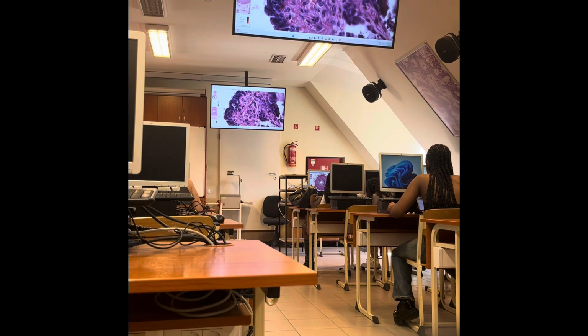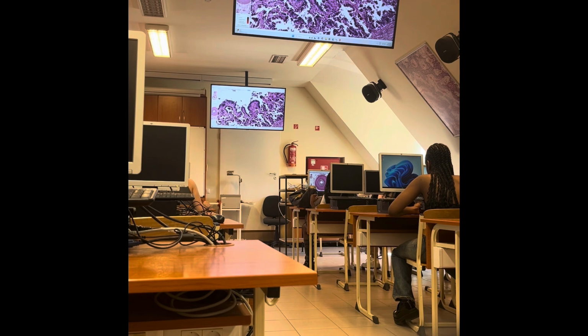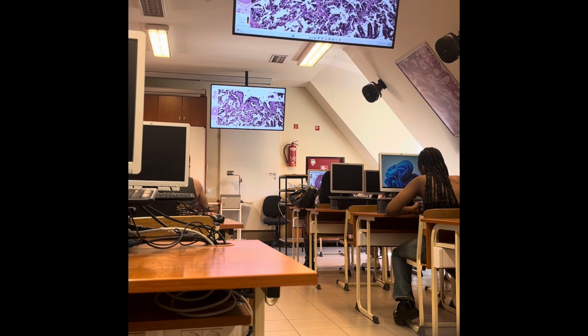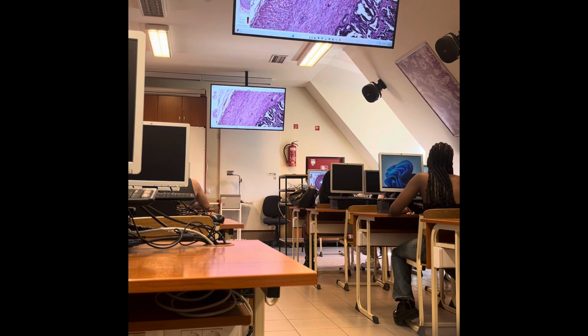Lamina propria is the next layer, connective tissue. Many blood vessels you can also recognize in the connective tissue layer, and it has some folds and side branches, so it has a kind of irregular appearance in this way. And then we reach the end of the lamina propria, approximately here. And now if you look at the muscle layer, though it's not so regular, maybe in this part you can see the muscularis externa layer.